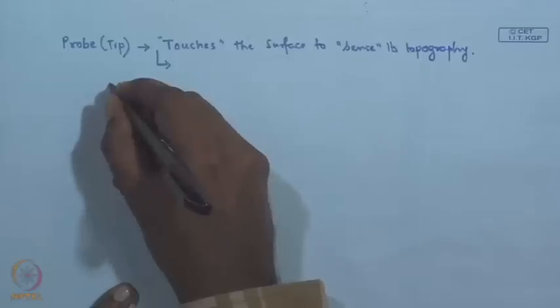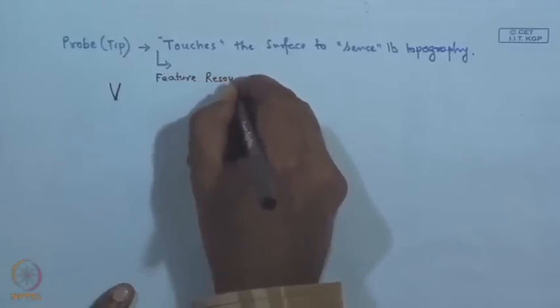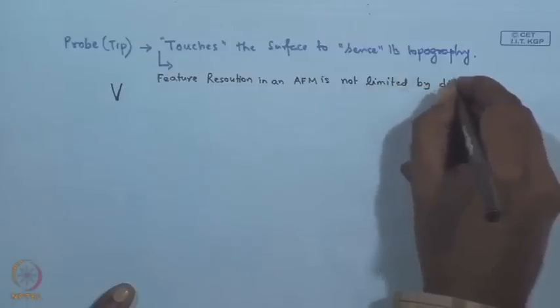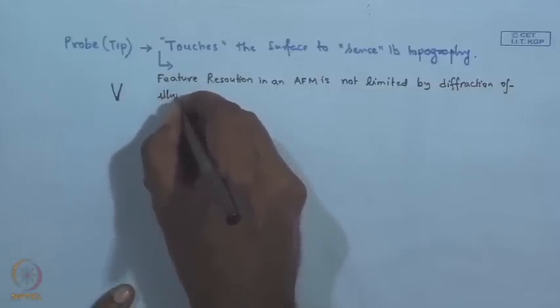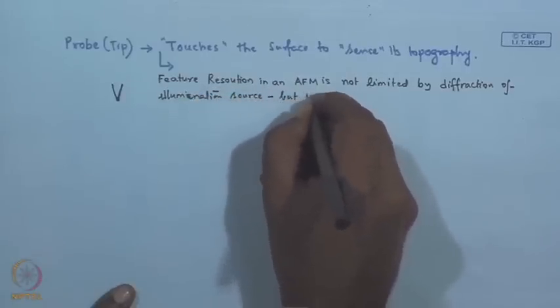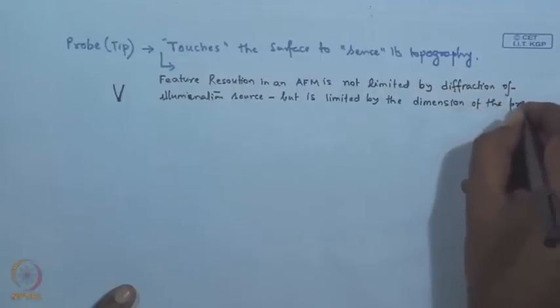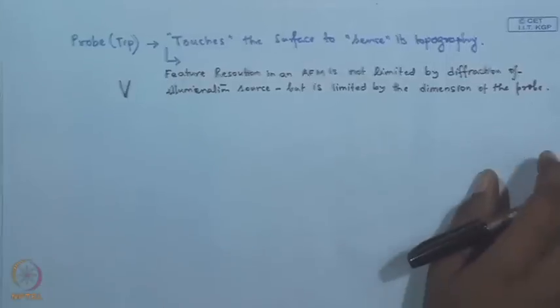because you must understand that the feature resolution here is not limited by diffraction of the illumination source, but is limited by the dimension of the probe. Okay. So finer is the probe geometry, or the sharper is the probe, better would be the resolution.